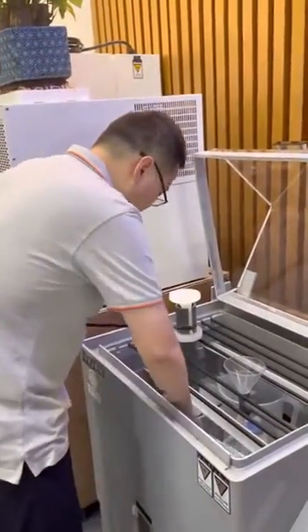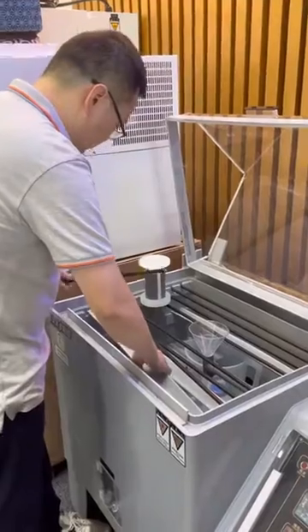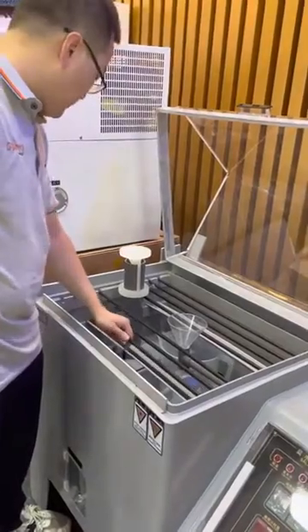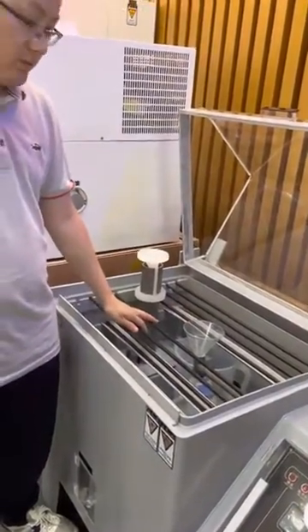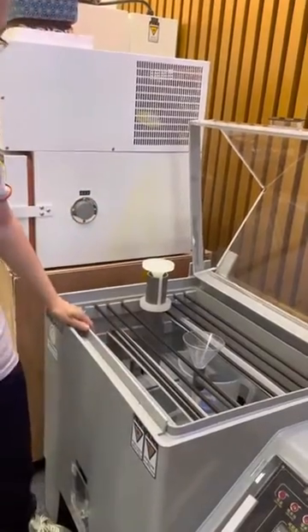This is the second shelf. This is the middle shelf. This middle shelf you can choose — you can move this and the second shelf. This depends on you.